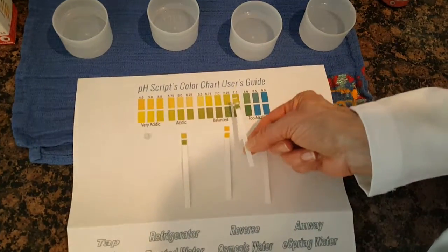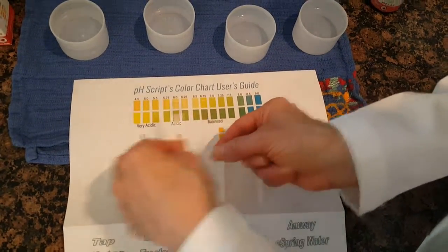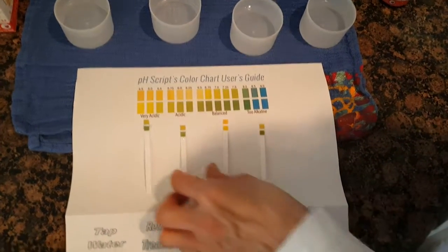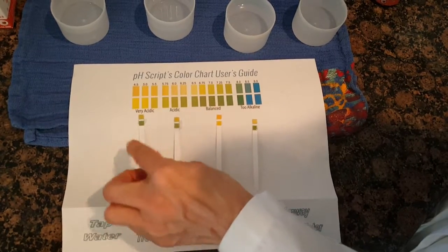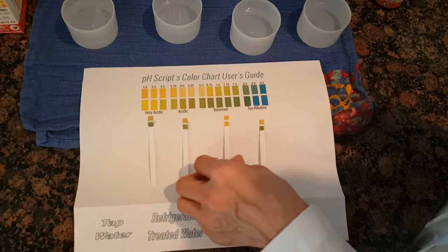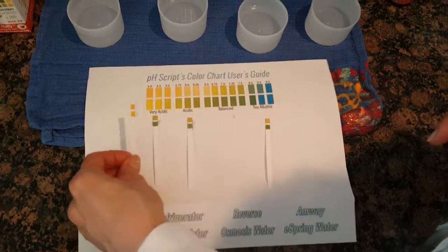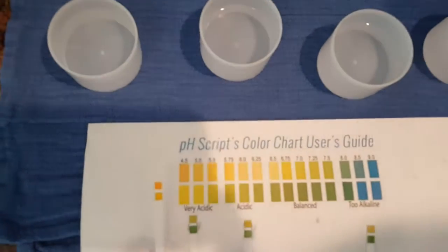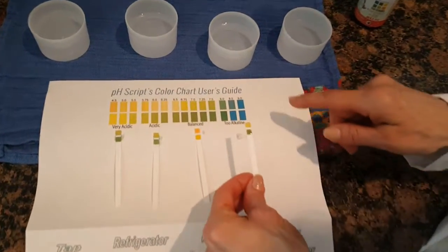So tap water is coming in around 7.0 to 6.75. The refrigerated water is kind of equal with the tap water — around 6.5 to 7.0. Oh my goodness, look at the reverse osmosis — I might as well be drinking vinegar! This is crazy. Let's put that one aside.